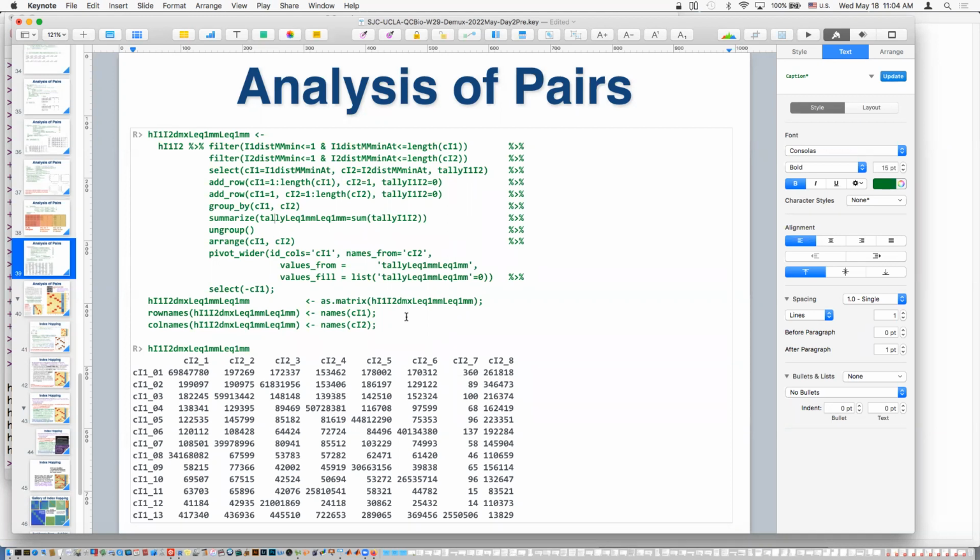That's it. That gets rid of the many entries in our original table, because our original table is organized by the full 16-mer read from the pair of index reads. Reads that go to the same Demux files and meet the requirements in this method, we no longer care about the particular sequence that lands there. We just want the sum. So that's what this group by, summarize, ungroup is doing. It gets us to the point where we now have one row for each unique combination of I1 and I2. It's basically the matrix, but written as row number, column number, tally. But it only has one row now for each cell in the matrix.